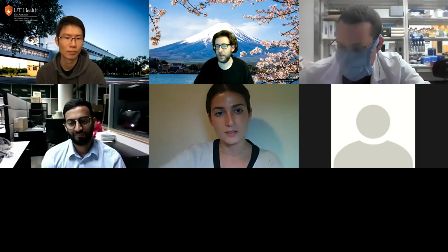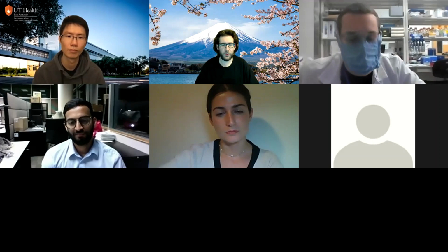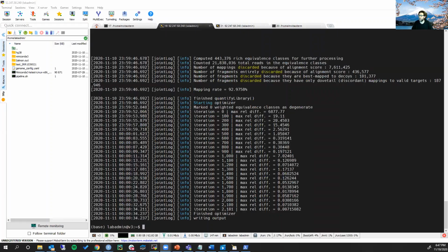So I can actually show you this on Windows. Basically, what you do, and I'm going to show this here. This is my MobaXterm. This is me connected to the lab server, but that's going to quit in just a second because I told them to shut it down. So I have Anaconda installed on my computer actually, and it should just take a second to show up here. It always takes a second to load.